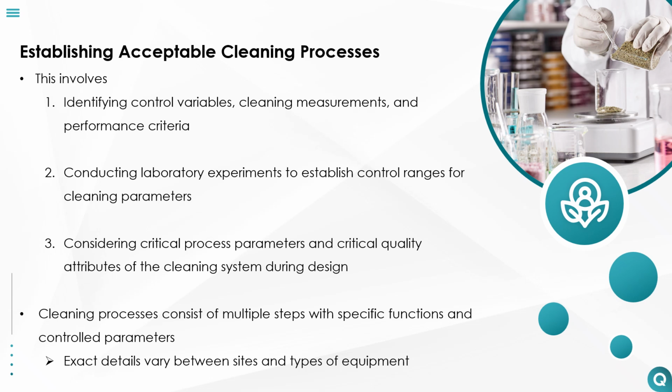Cleaning processes are composed of multiple steps. Each step has a specific function with set parameters to ensure effective soil removal. Exact details vary between sites and type of equipment, as each has its own unique cleaning process tailored to suit its function.